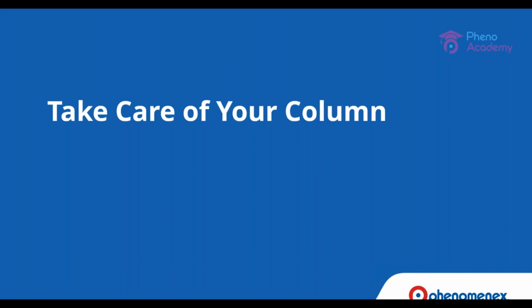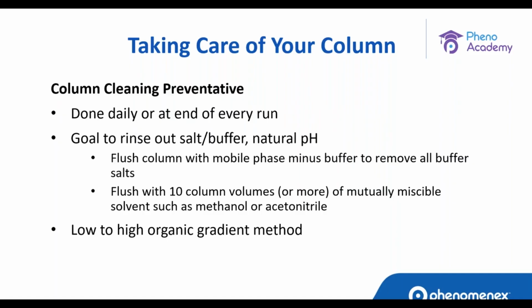Before I end my talk, I want to use two to three slides to show you how to take care of your column as well. Clean your column to prevent a shorter column lifetime. With daily use, at the end of the day, please make sure you clean your column. The goal is rinsing out and washing out all the salt and buffer using neutral pH. Also use a gradient method from low to high organic to wash out all the impurities and carryover compounds that stay in your column.